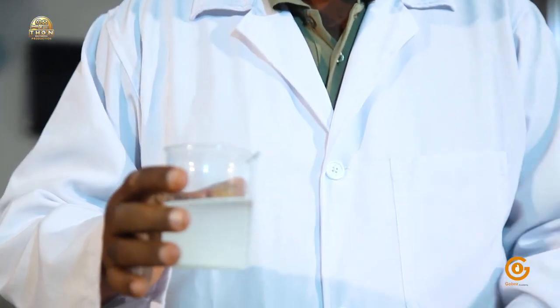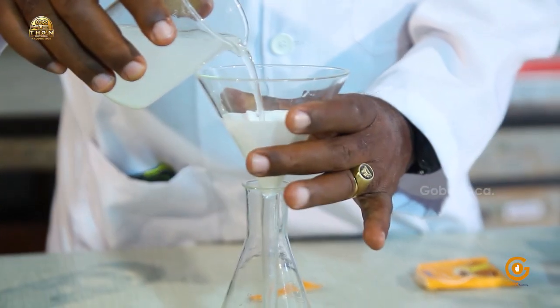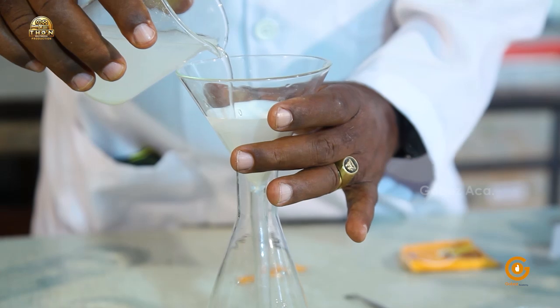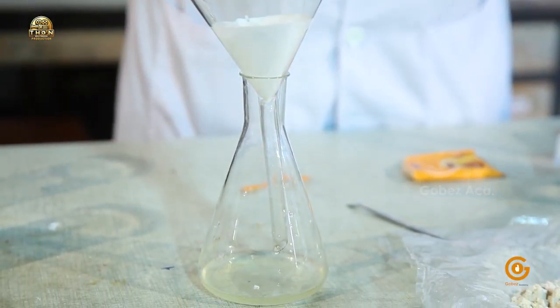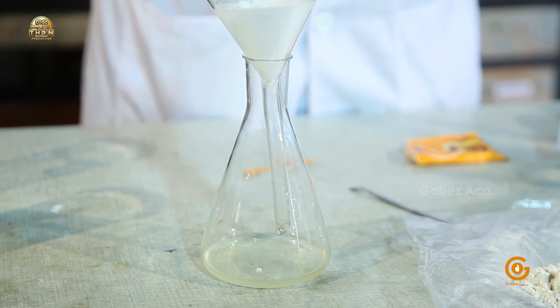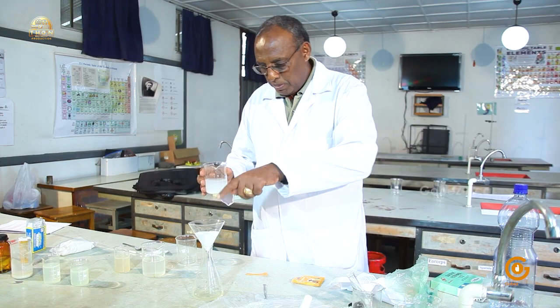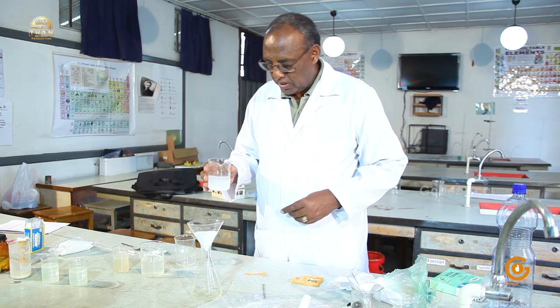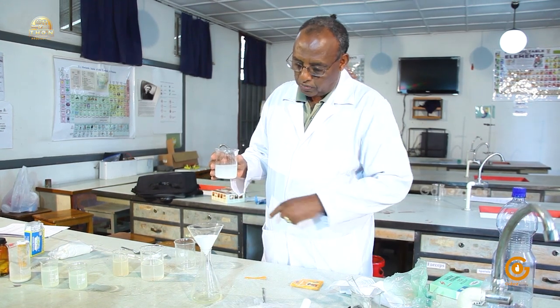It's going to take time, but I would like to filter it to get some idea about the amount of the substance that has dissolved. If we see some precipitate on the filter paper, that indicates it has not dissolved completely.